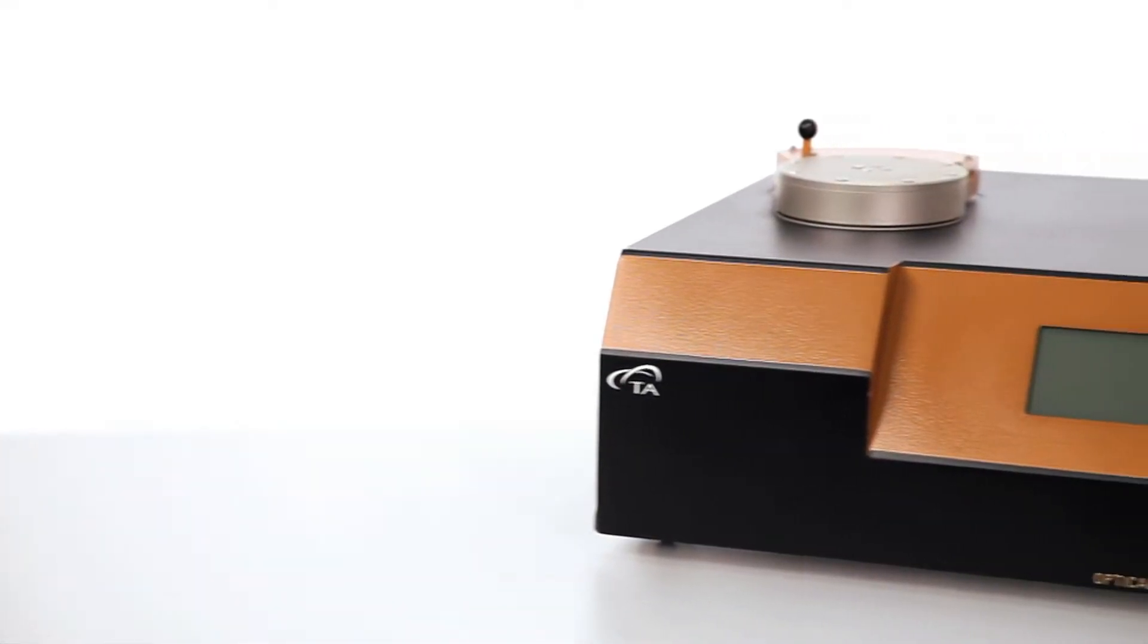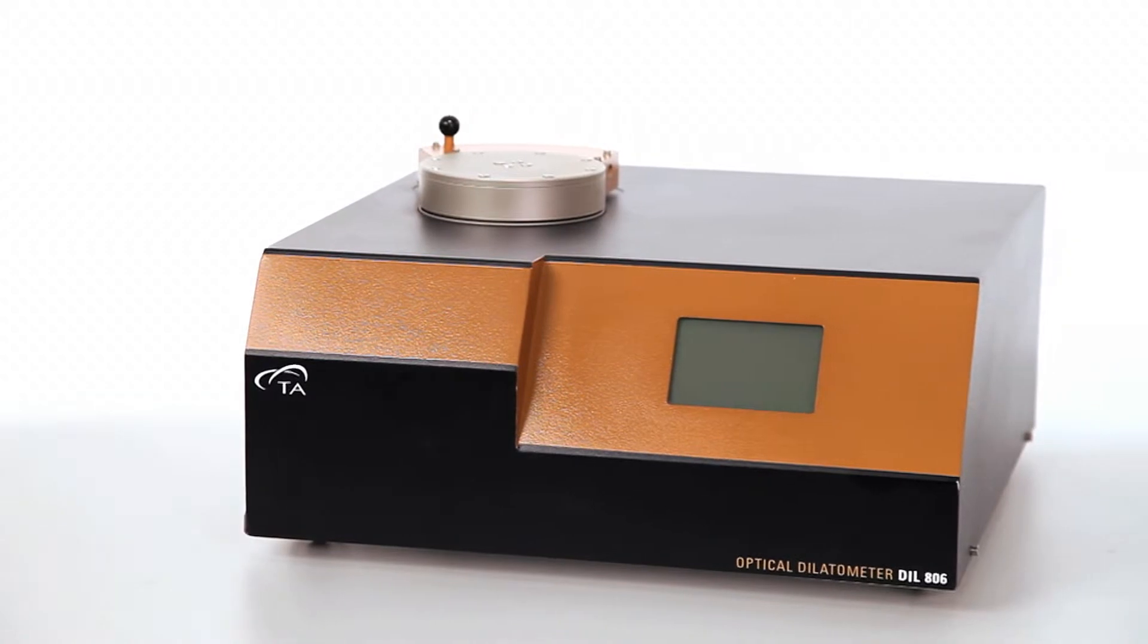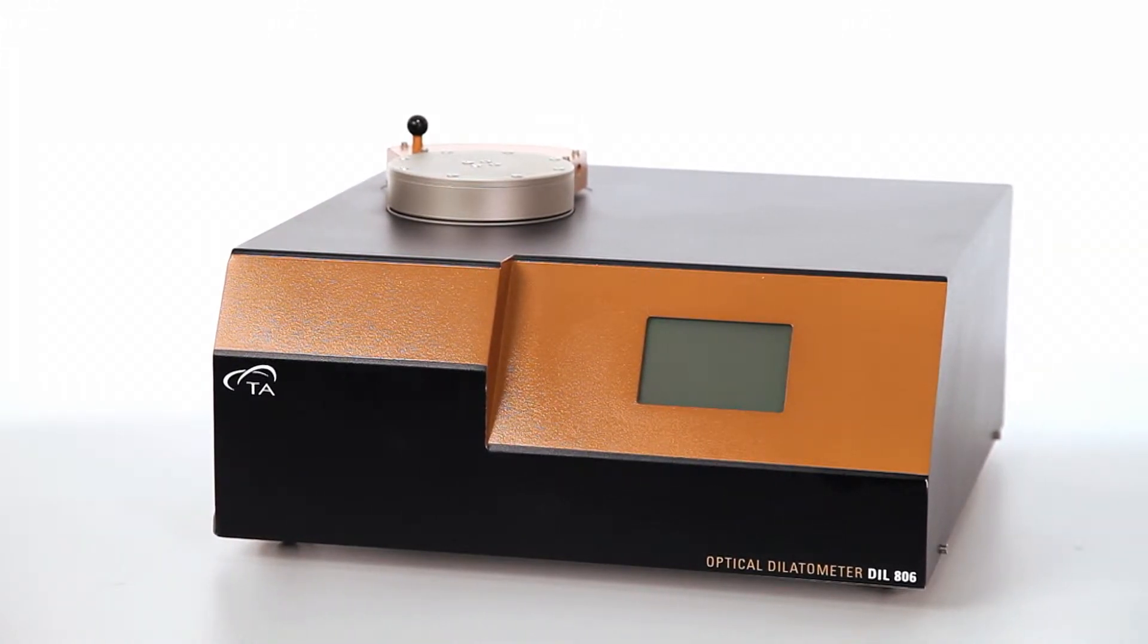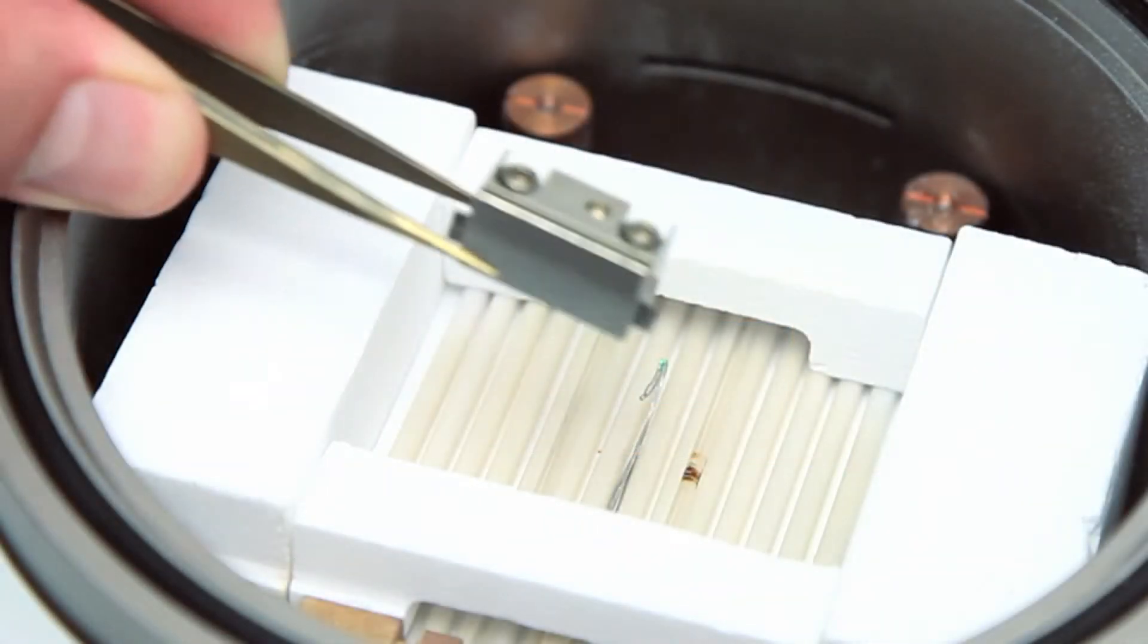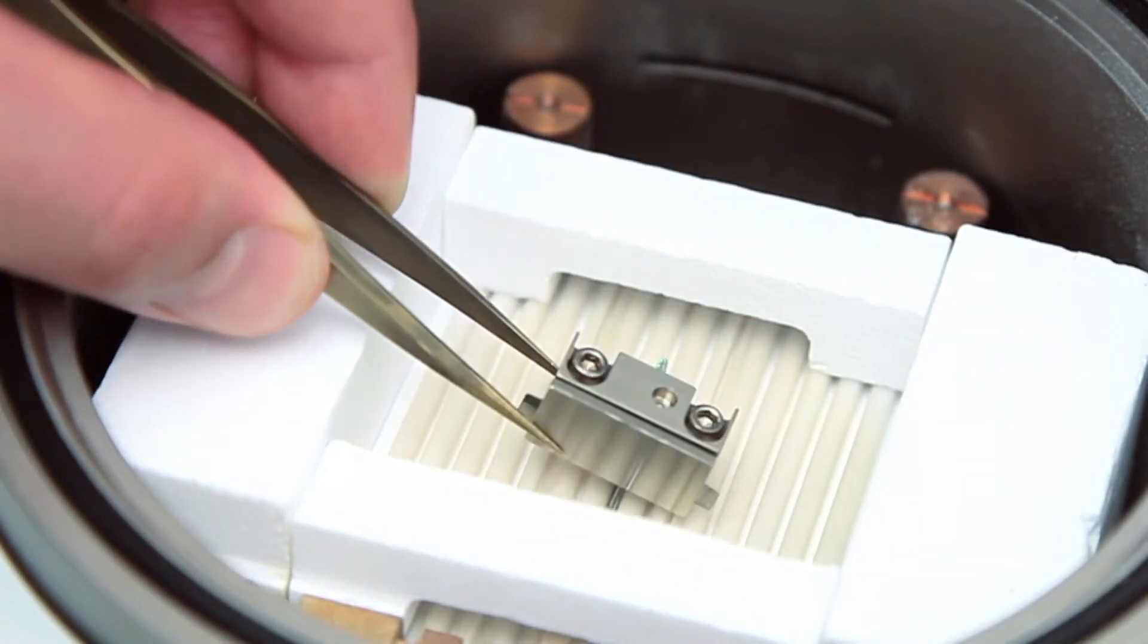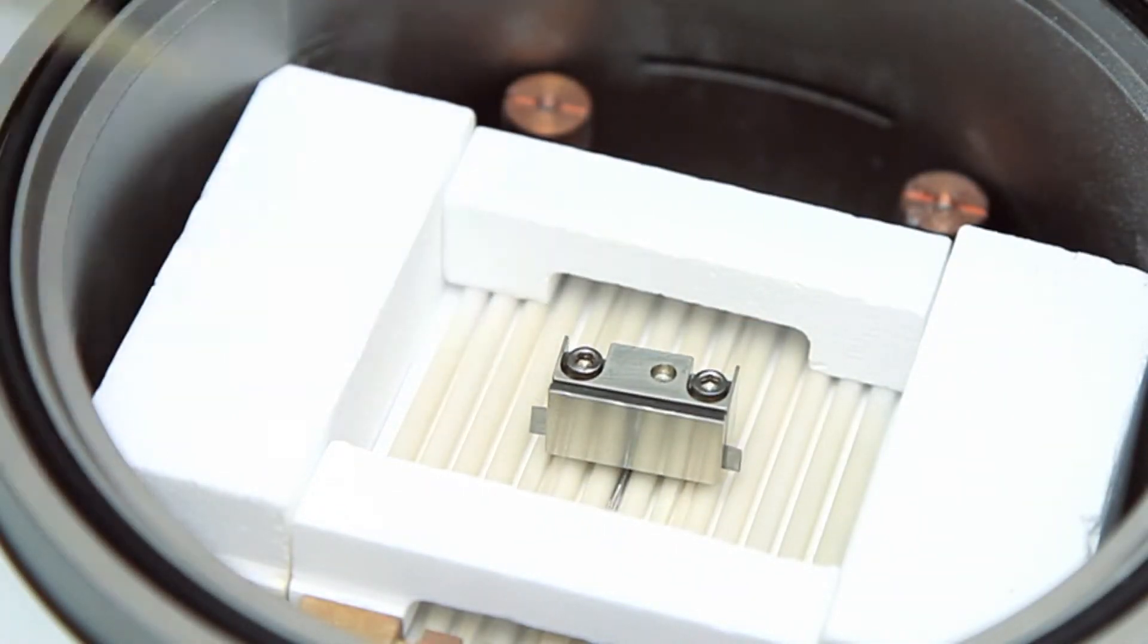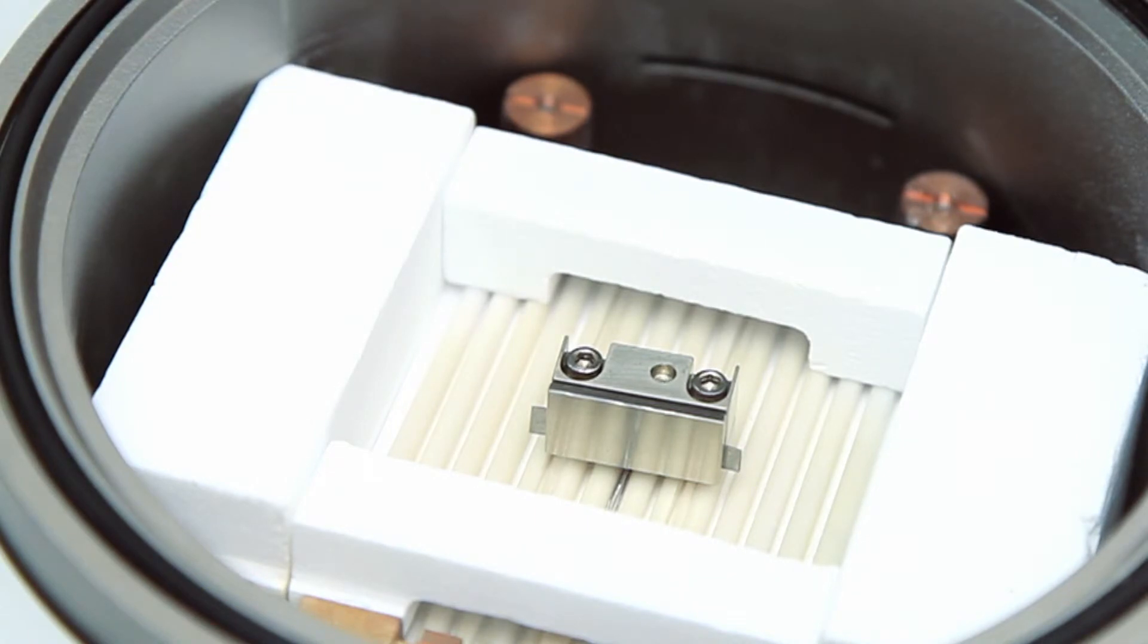Optical dilatometer is ideal for characterizing thin films and other softer materials with sample size and preparation restrictions. One of the advantages of DIL-806 is to be able to run thin samples since the measuring system does not have any contact with the sample.